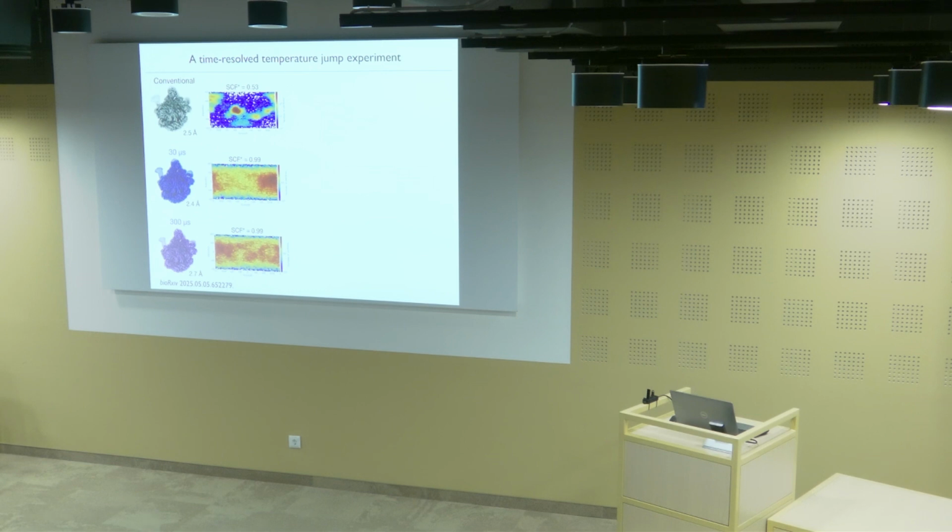Right? And we're currently trying to figure out whether this might be general and might be a way to eliminate preferred orientation entirely. Last thing I wanted to mention, this 50S subunit of the ribosome is, of course, a flexible system that undergoes motions at room temperature. One of them is this L1 stalk motion, where I'm showing you the first principal component. Now, this is a temperature distribution on our sample, where the sample gets hottest in the center, and this black line is where the temperature has dropped to 0 degrees Celsius. So we get a temperature distribution across the sample. We would expect that in the hottest parts of the sample, we should get the maximum amplitude of motion, and we should see less motion in the colder parts.